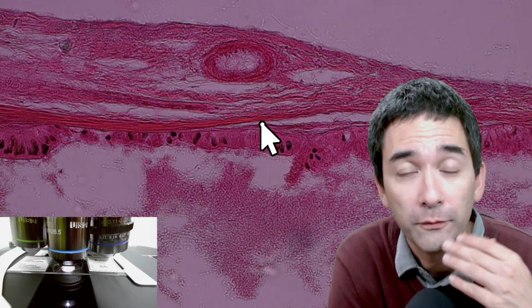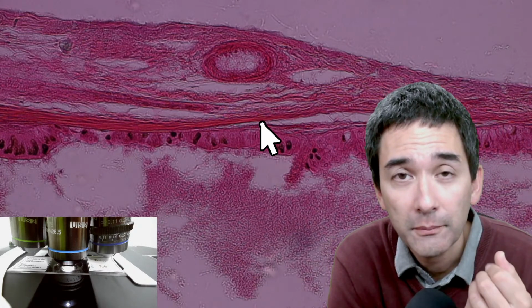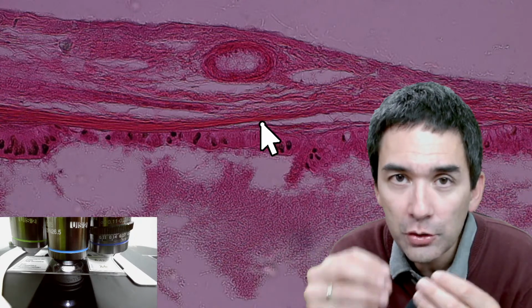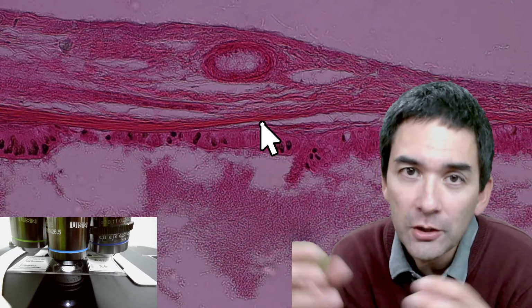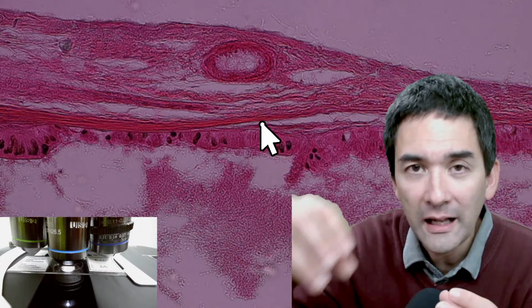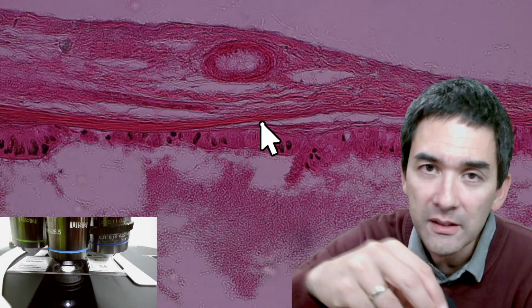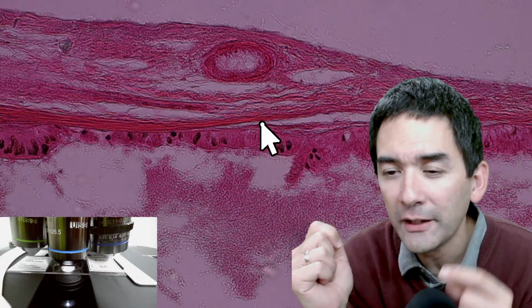I think they call it a formalin solution, and this infiltrates the tissue and conserves it. And after the tissue has been conserved, you have to take the water away without causing the tissue to shrink. You do that by placing the tissue into an alcohol series. That means you slowly go up with the alcohol concentration, and you leave the tissue in this for several days.